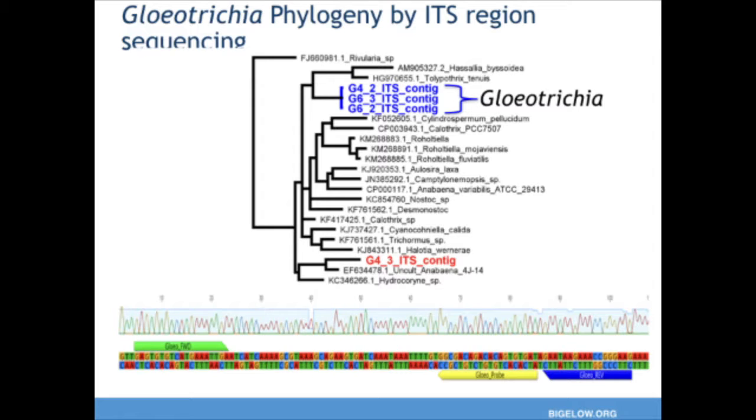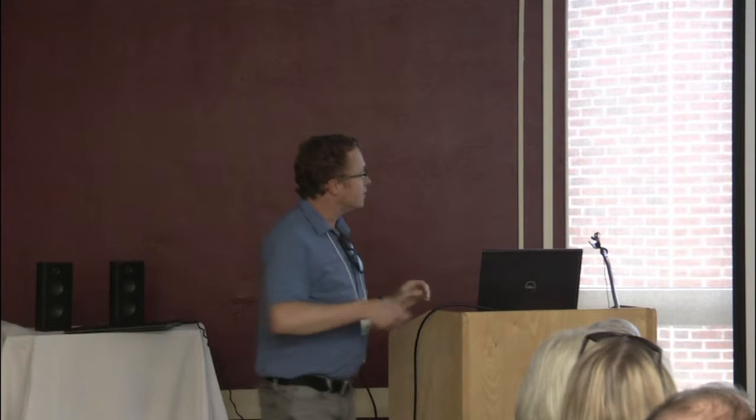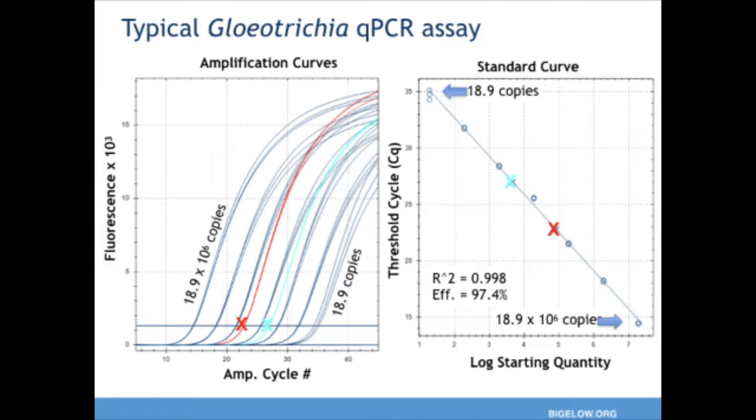This is the little short strand of DNA that we amplify, and then these are the little probes that we add into our sample to make these carbon copies of this short region. The short region is only, I think, about 120 base pairs or so. And this is what it looks like on the computer screen. You start off with nothing there, and then all of a sudden the lights come on as the first sample starts to amplify. And as the cycling progresses, the DNA standards and the unknowns start to amplify.